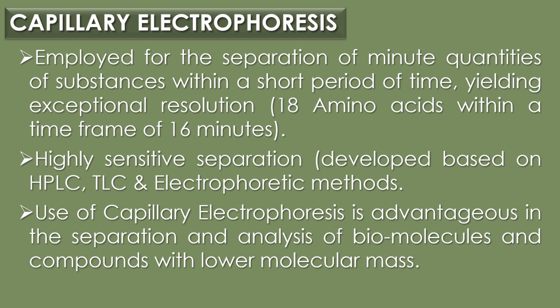Capillary electrophoresis is a highly sensitive separation technique that has been primarily developed based on the concepts of high performance liquid chromatography, thin layer chromatography, and electrophoretic methods. The use of capillary electrophoresis has proven to be advantageous in the separation and analysis of biomolecules and compounds with lower molecular mass.